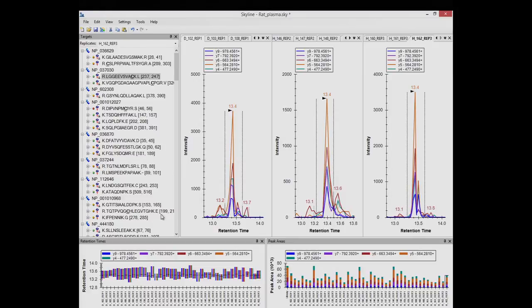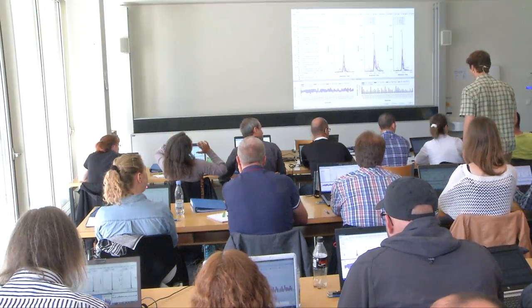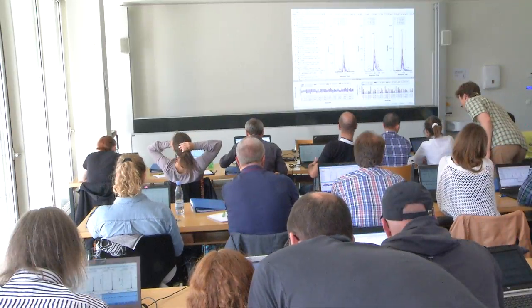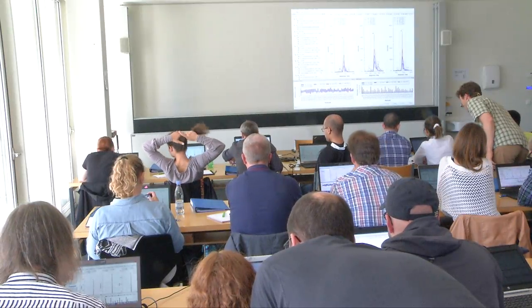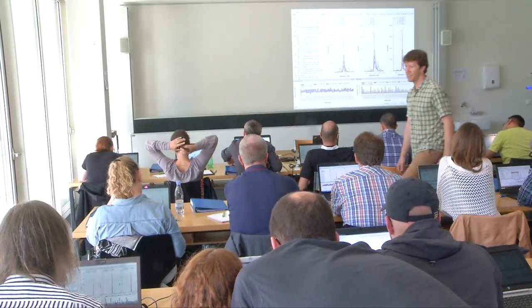And people, raise your hands if you don't think you have this view at this point. Pretty good. Oh yeah, this is exactly what I was talking about. So all you have to do is grab this and dock it over to the edge. Make sure that it has this title bar, and then you might just do that same command again. And there you go. Okay.